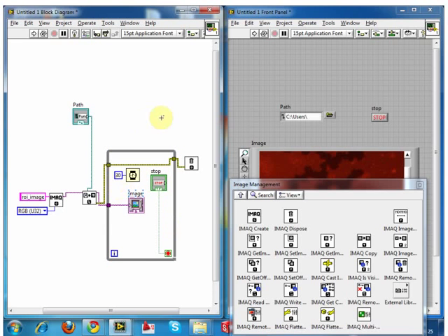So if you left click on the arrow out, yeah, okay, and then we just move our mouse to the other side of the loop, and then click on the edge of the loop, yeah, okay, you should have that, and then left click on this side of the loop and go to the arrow in. Okay, now we're running it in sequence. We okay?